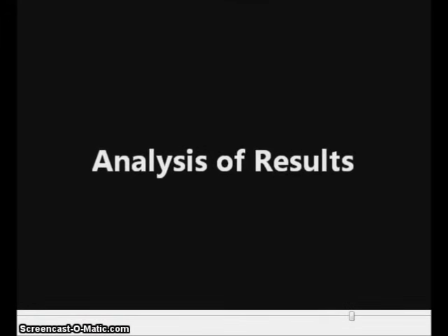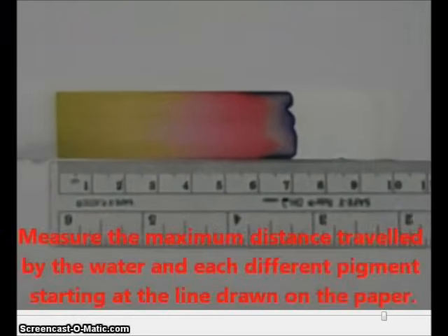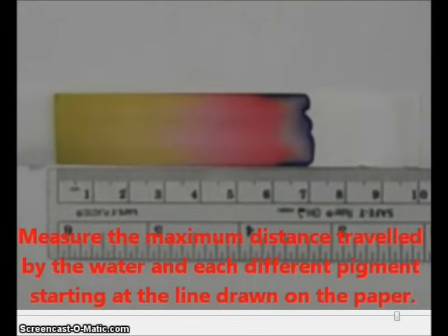Now, to do analysis of our results, what we're going to want to do is to measure the distance traveled by each pigment. Let's pause here for a moment. I want to measure the maximum distance traveled by the water and then by each different pigment starting at the line drawn on the paper.